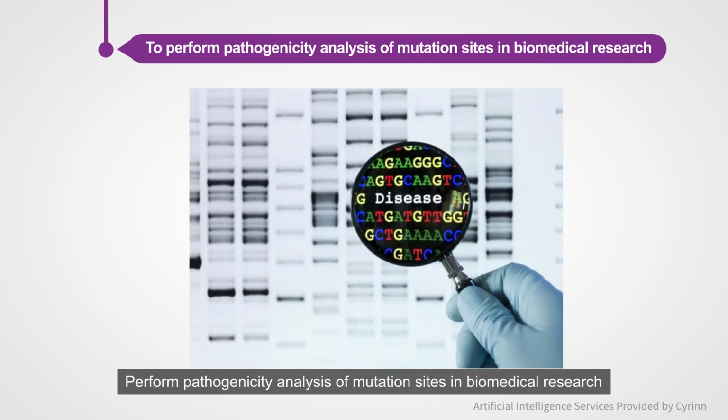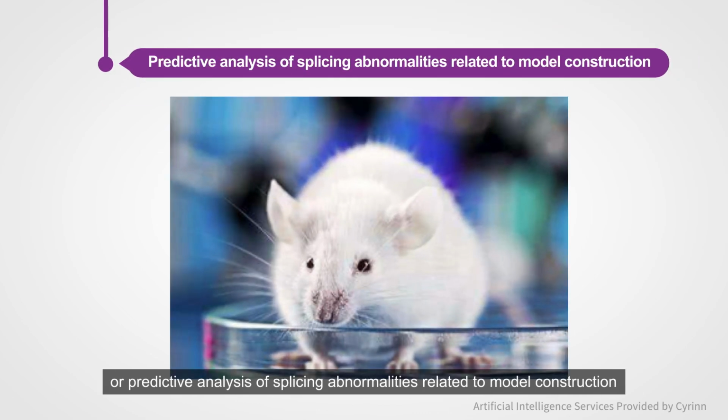Perform pathogenicity analysis of mutation sites in biomedical research, or predictive analysis of splicing abnormalities related to model construction.